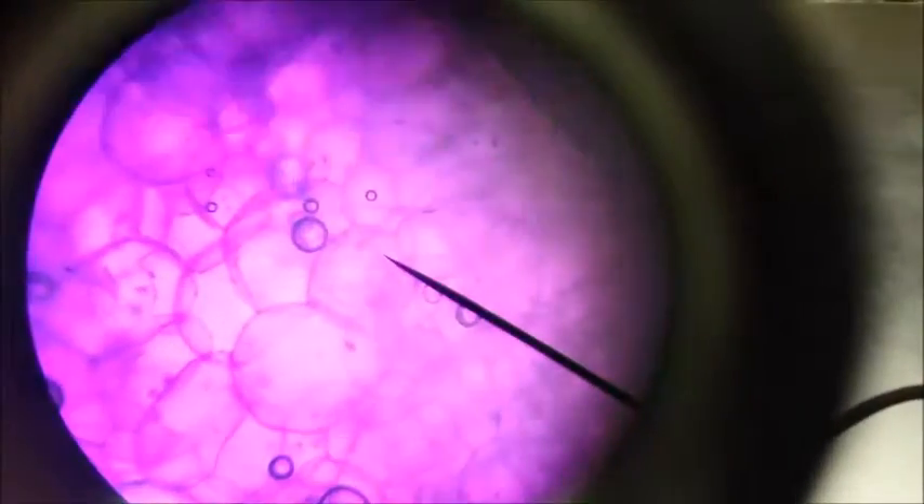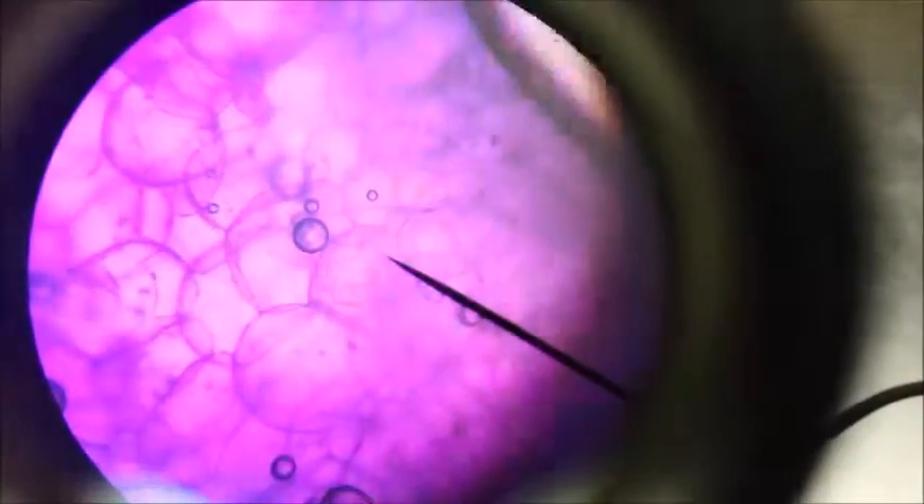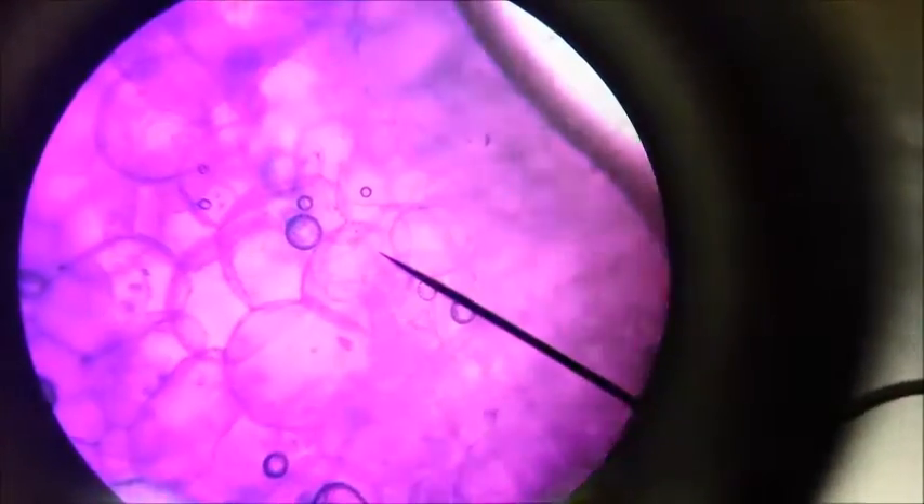The first one that we looked at of the onion pith was 40x magnification. But beautiful cells and wonderful nuclei. Not bad.